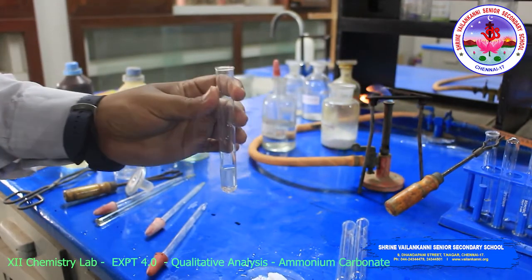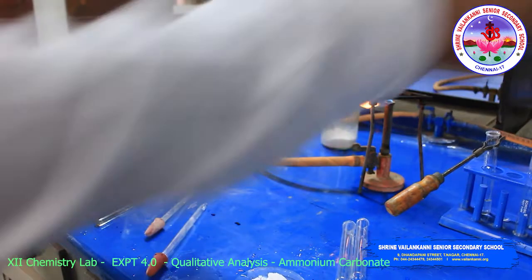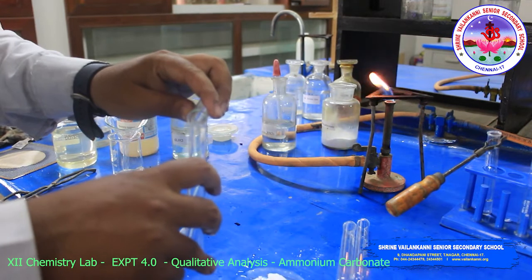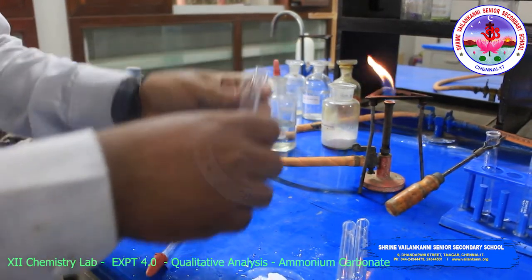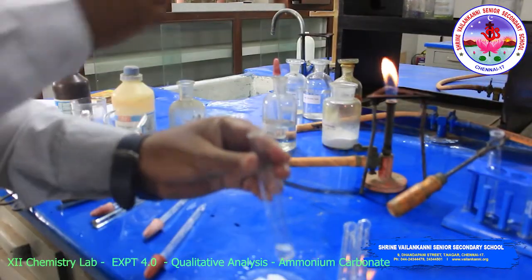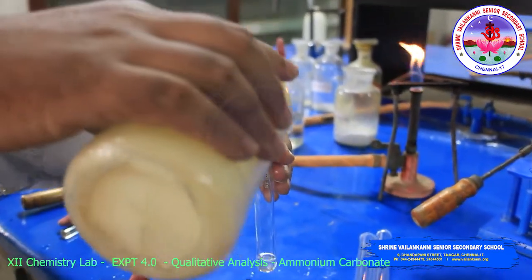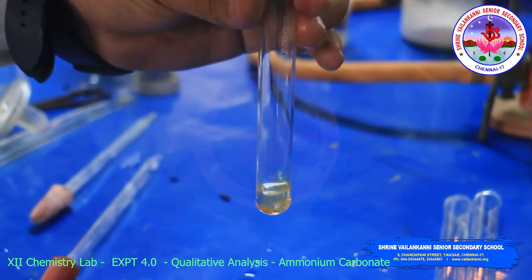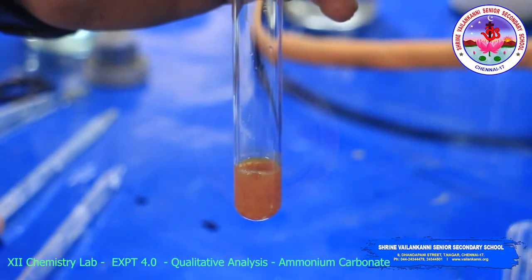Now we will do the test. Take a small amount of the solution, then add Nessler's reagent. A brown precipitate is obtained.